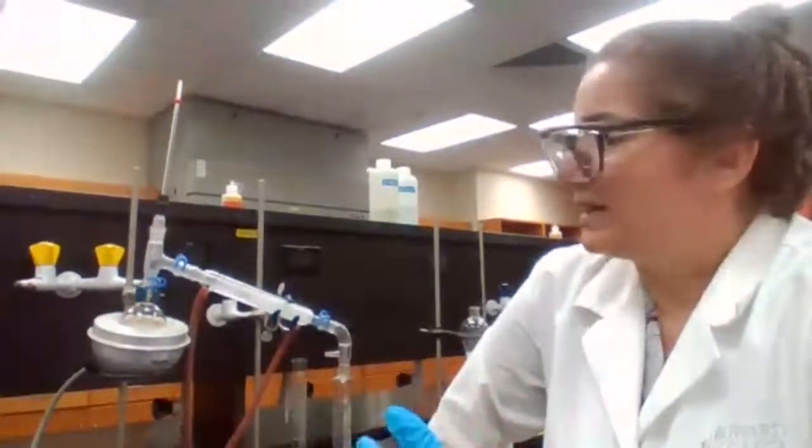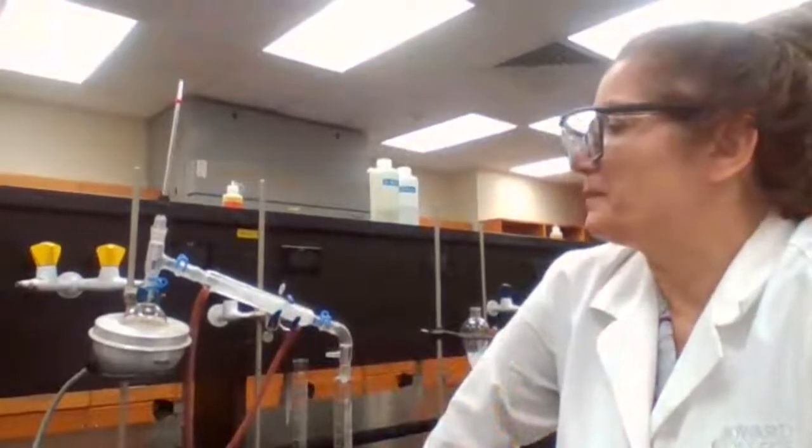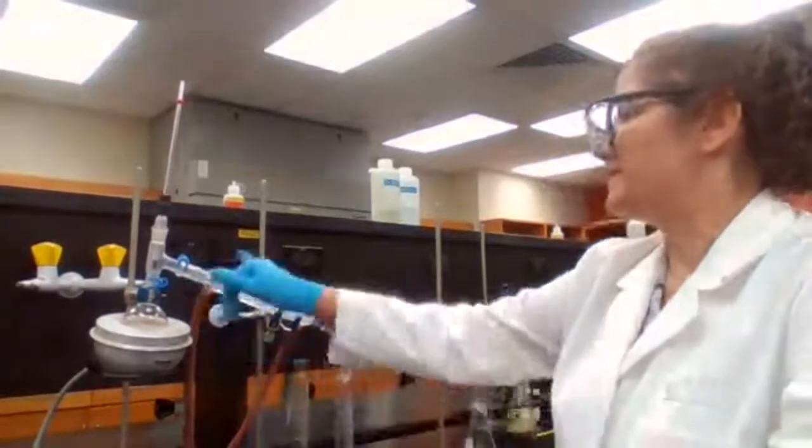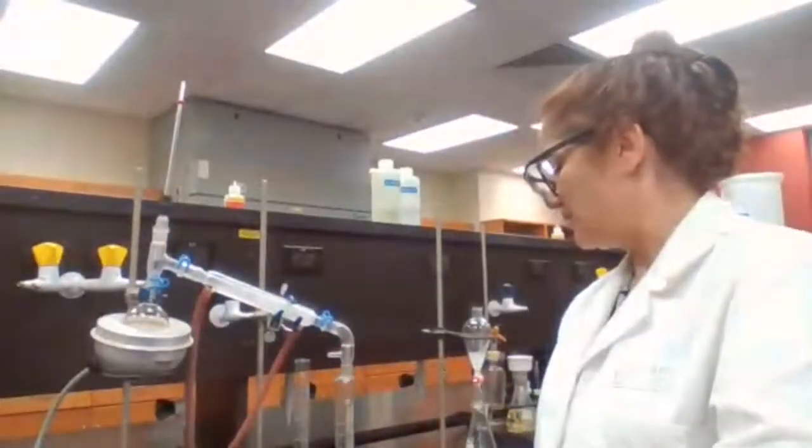In the previous edition of the lab manual, when I was writing this experiment, I called it steam distillation, and then students were looking for the 3-neck flask because that's what we used for steam distillation last class. So I had to change it to just a simple distillation, but the idea is steam distillation. Basically, you are doing steam distillation with the setup of the simple distillation. So steam is bringing the amine into the receiving flask.